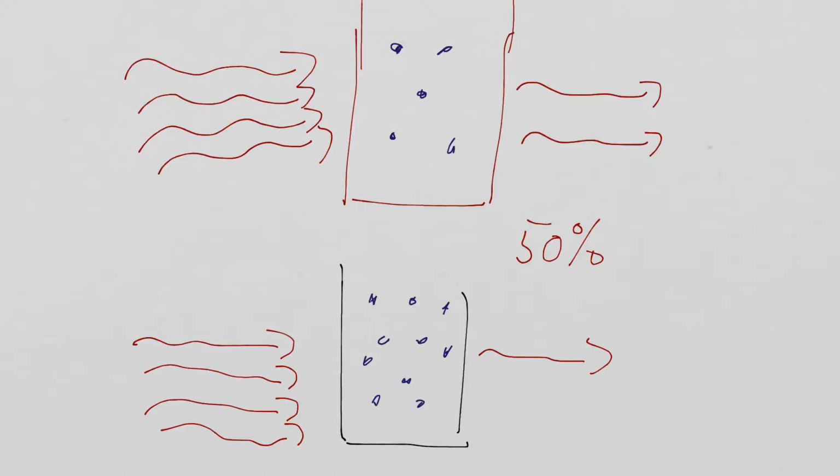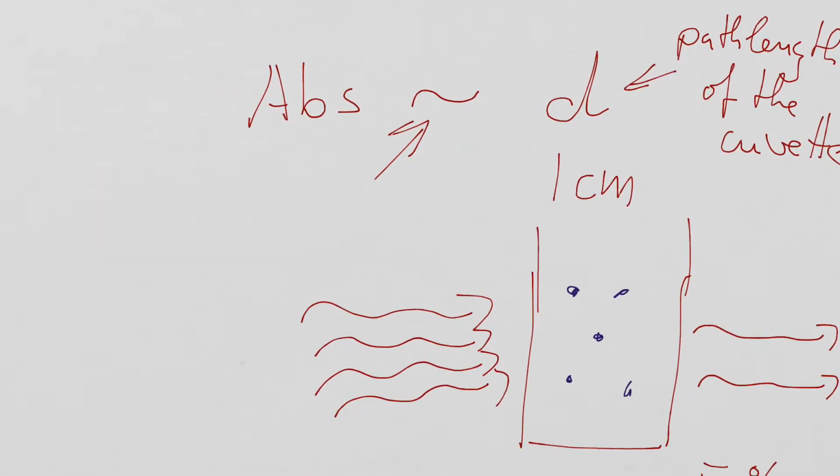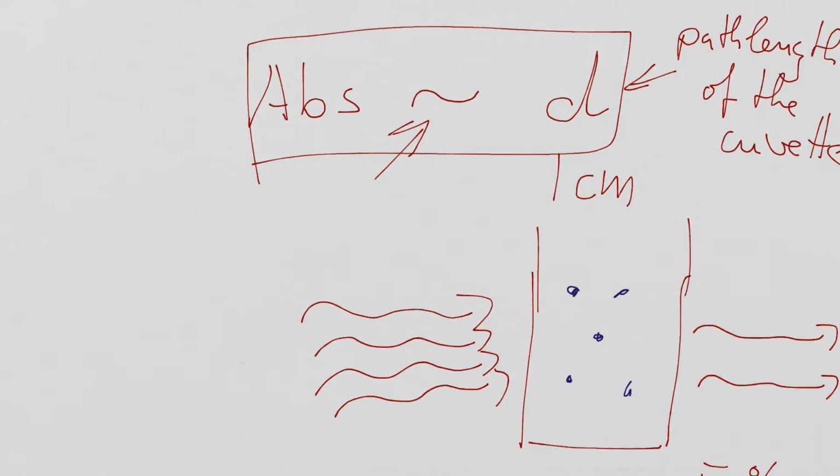So the absorbance, in this case here, is not just dependent on the length of the path, but it also depends on the concentration of the substance.